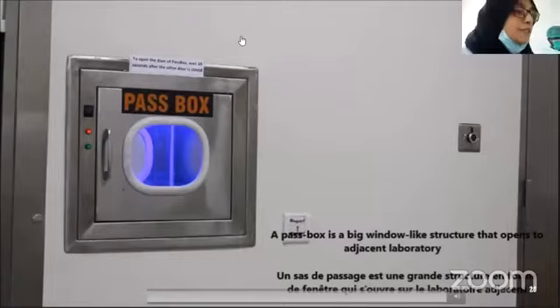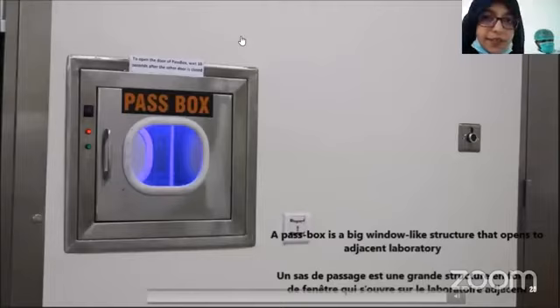The first question was about the carrier RNA, whether it is commercially available or we can prepare it. So it is commercially available, in the lyophilized form, and we reconstitute it by using the elution buffer. So it is commercially prepared.